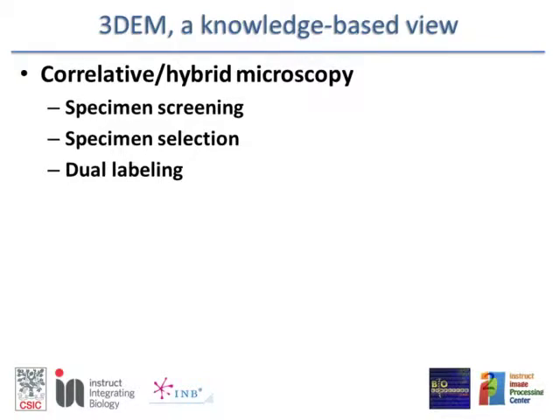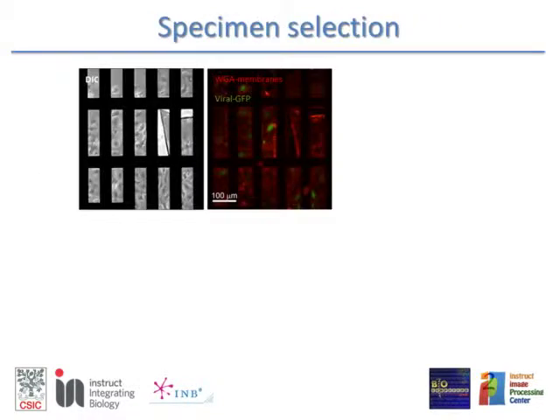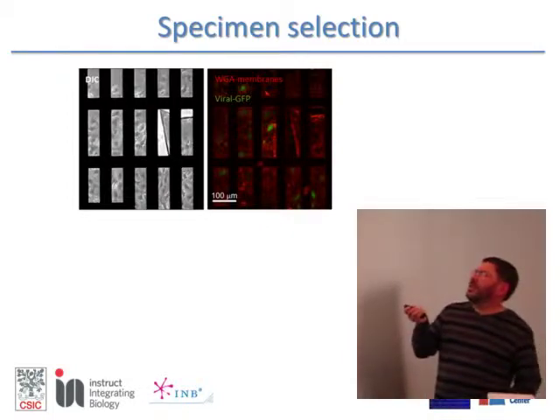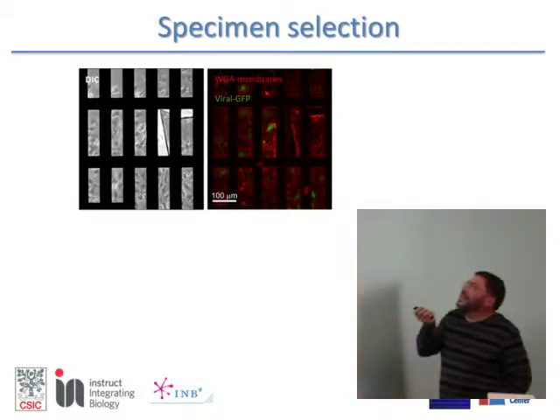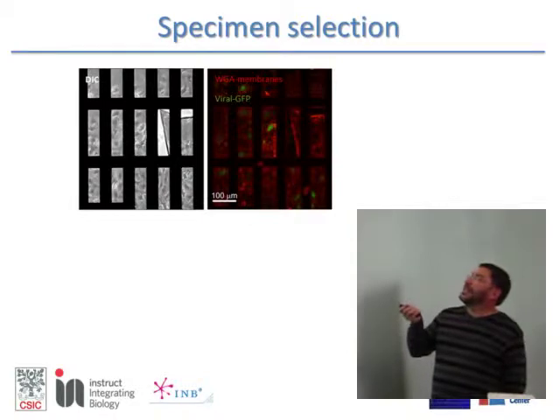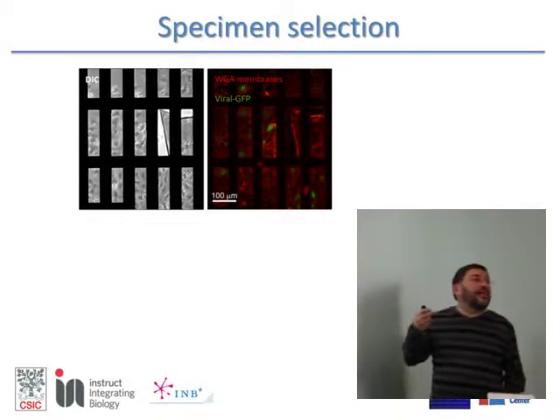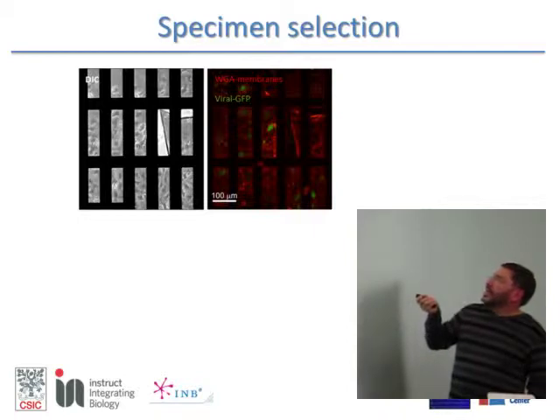And in which way? For many things. Let me present you a real flow of something we do, especially for the X-ray microscope. You have a certain electron microscopy grid. For those of you used to electron microscopy, you will say, what a strange grid. These are just strange grids for other matters. But you see how the grid looks in the optical microscope. Here you see how it is in the optical, but with fluorescence. So you see that we are interested in following a virus inside the cell. I see membranes, and I see green where the virus is.